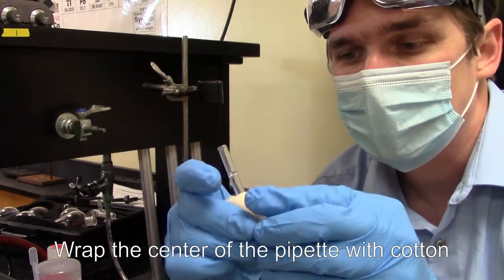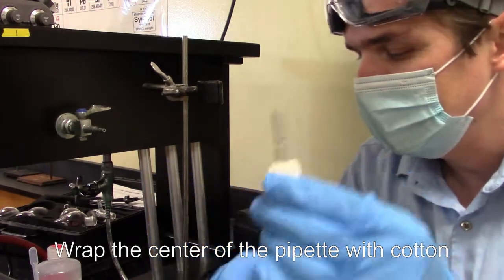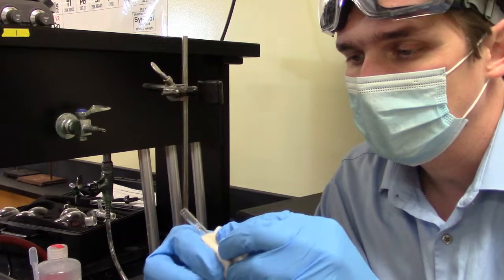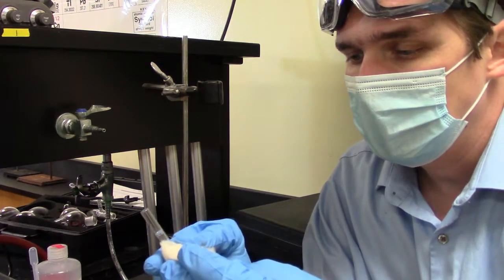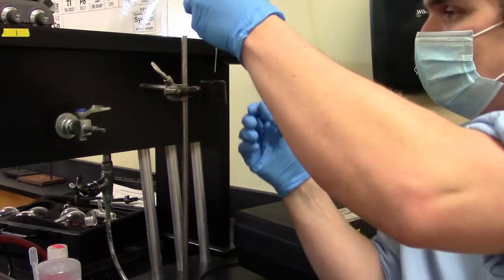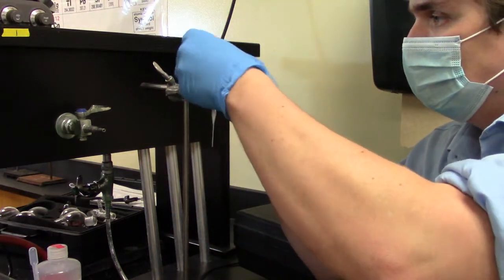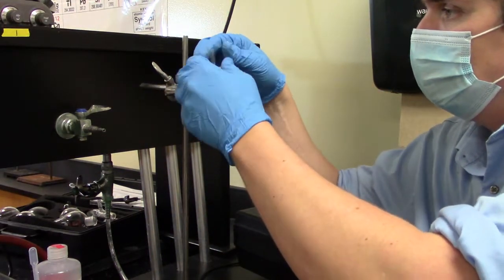I'm going to take my pipette. What I want to do is I want to wrap the center of it with my packing material. In this case, I've got some cotton. I'm going to pack this as tight as I can. This is going to serve as the support for the pipette. When I get it all in there, I'm going to slide it down into my holder. This should keep my tube pretty secure.